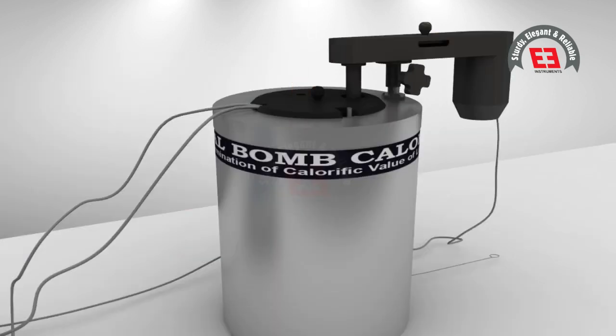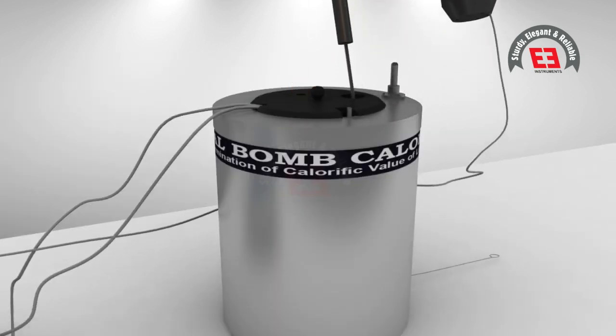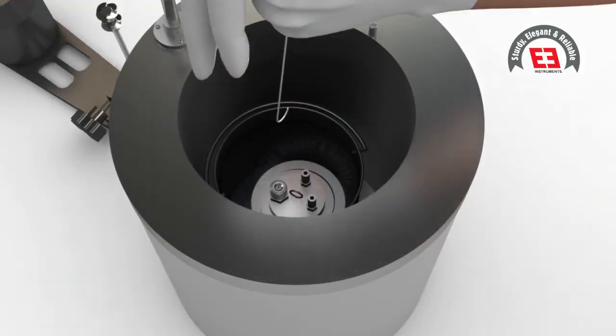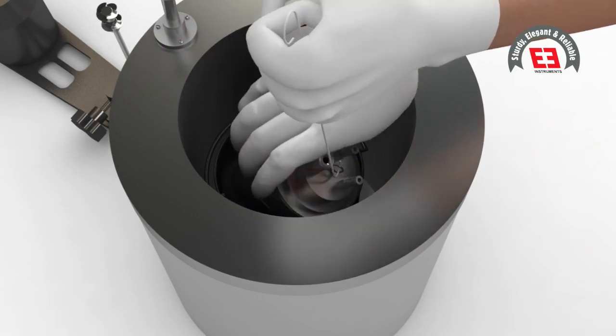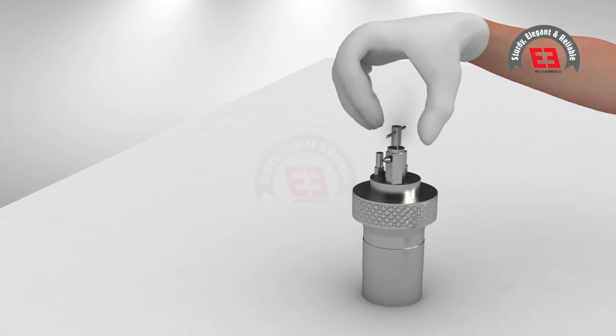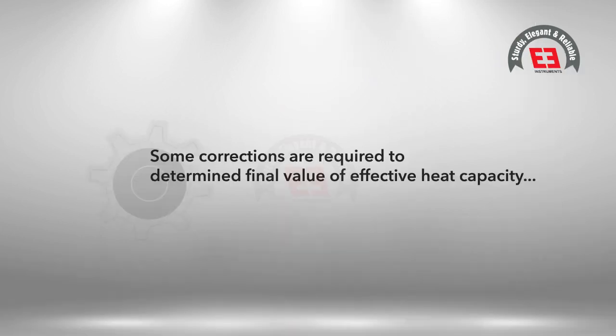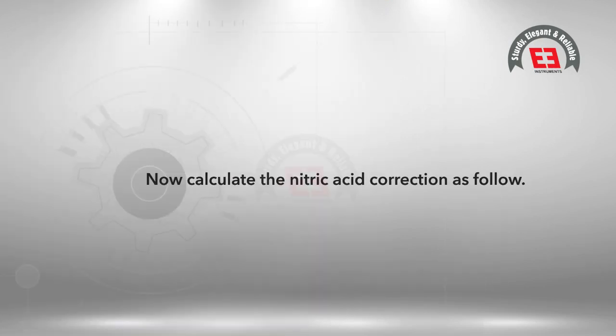Remove the stirrer motor and sensor from the top of the vessel, and also remove the lid. Remove the bomb from the calorimeter vessel. Release the pressure by pressing the release valve and dismantle the bomb.